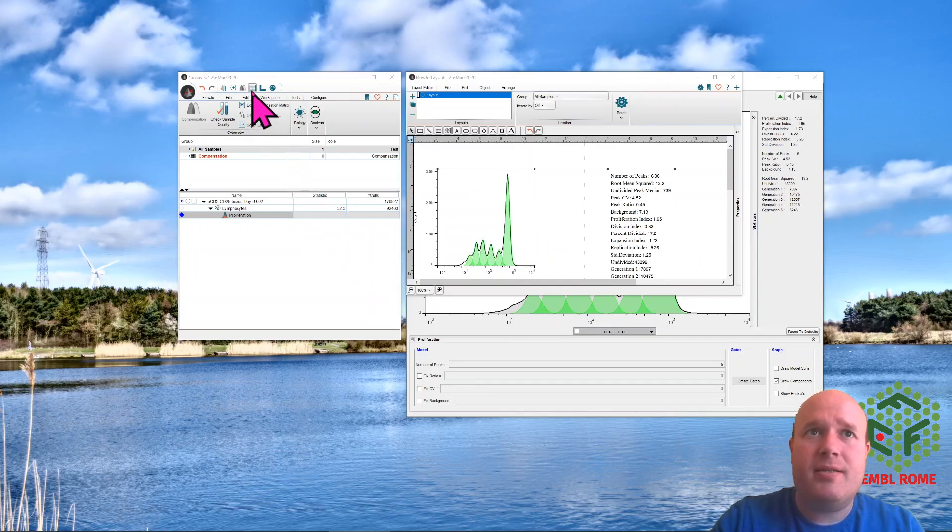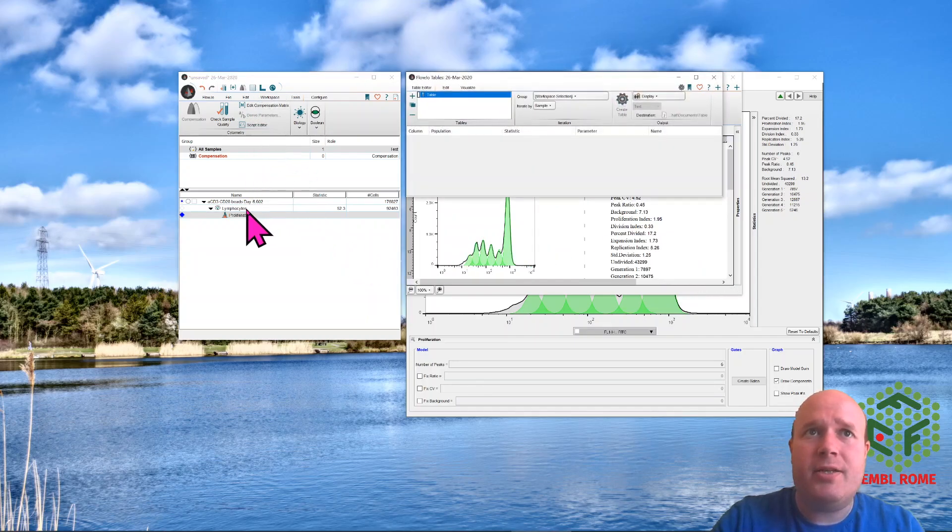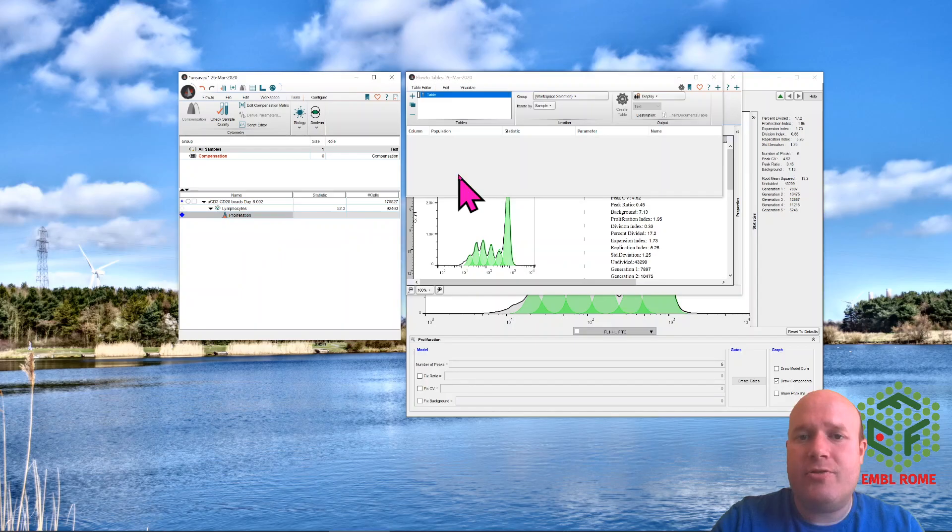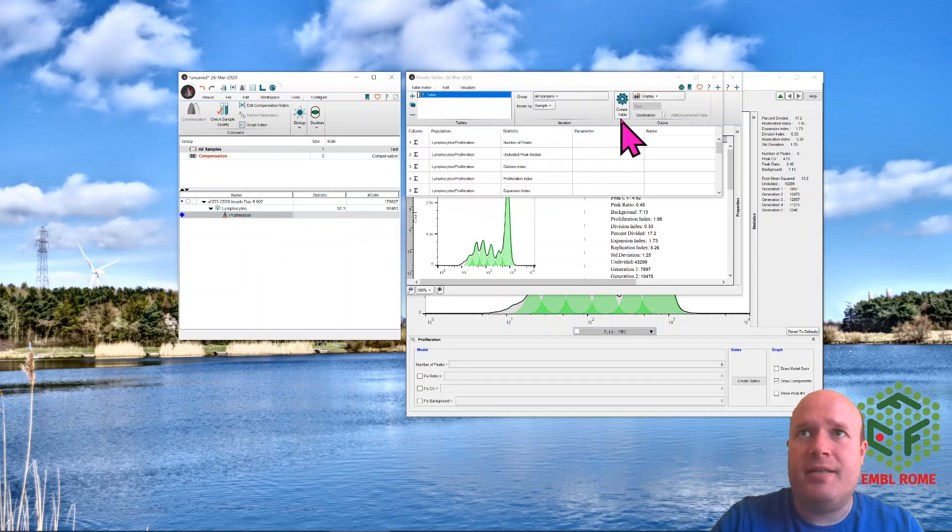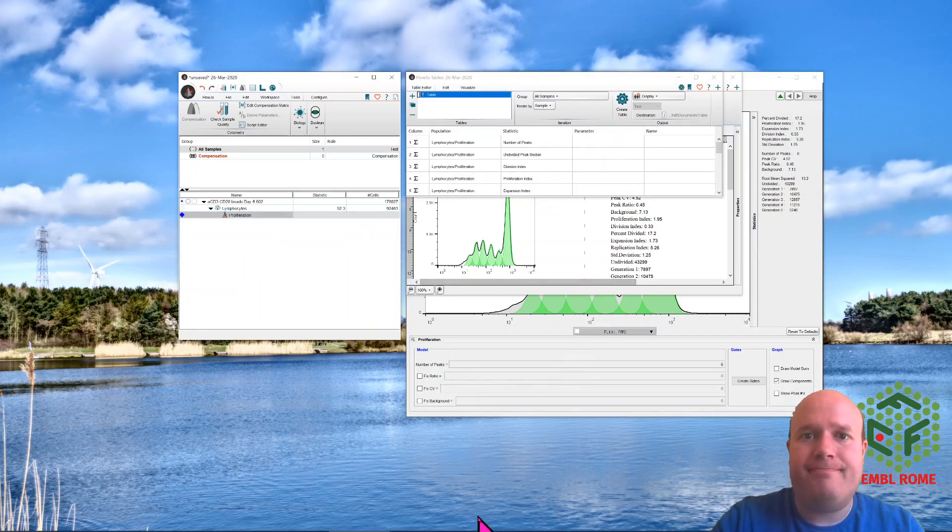If you want that data, you use the table editor, drag it across again and create a table. Very simple. Goodbye.